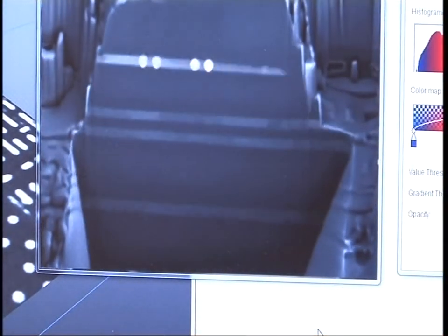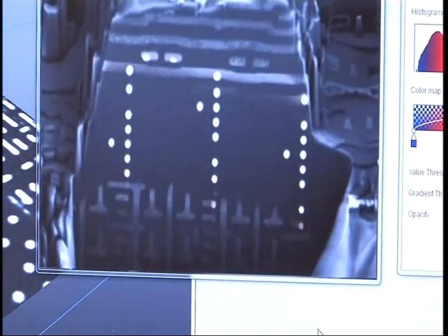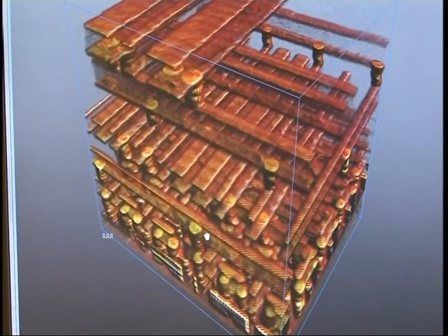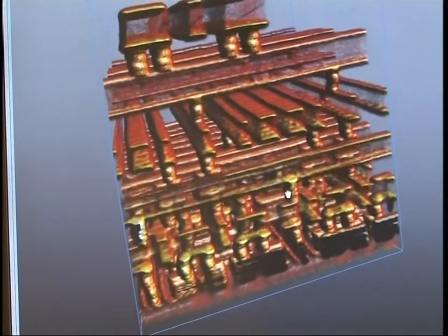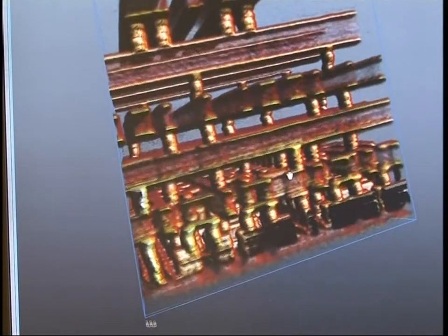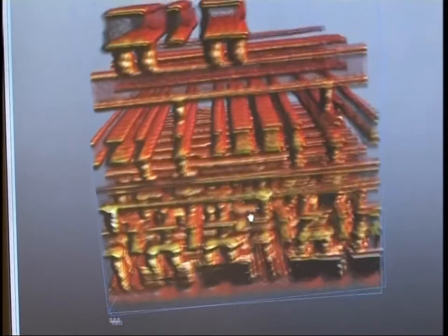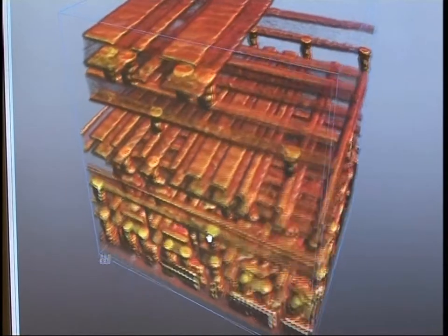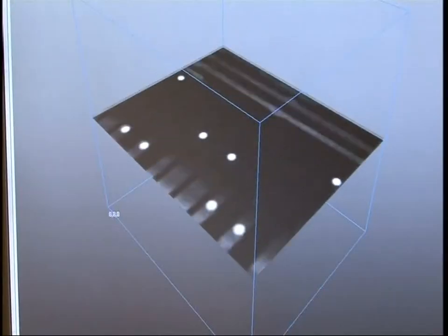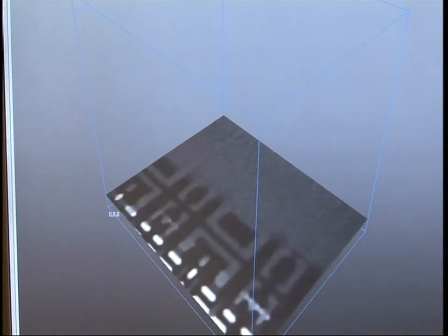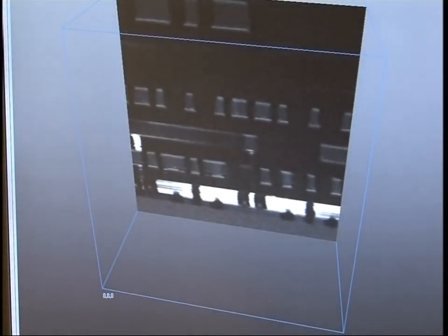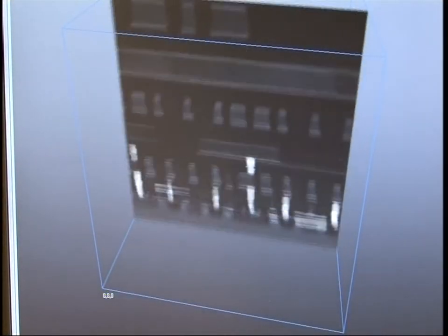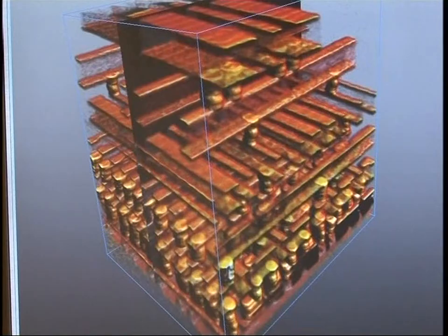This method can be used to control the quality of integrated circuits. The obtained 3D image, in our case one of a microprocessor, can then be observed from different angles, perform various cross-sections, and so on. We can thus precisely control the quality of the individual circuits in the processor. A 3D image naturally has a much higher informative value than flat 2D images.